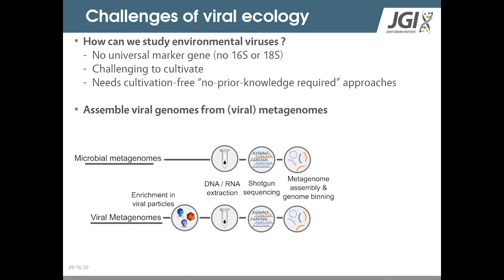If you really like viruses, you can add a pre-step, just before extracting the nucleic acids, where you try to remove cells and just enrich for viruses. And that will let you have more virus genomes at this step. It's recommended if you really want to look at your viruses. At the end of the day, what you have is a collection of genomes and sequences, and what you want to do is find which ones of them are viral sequences, and once you have identified these, then you can go on into a number of different analyses.